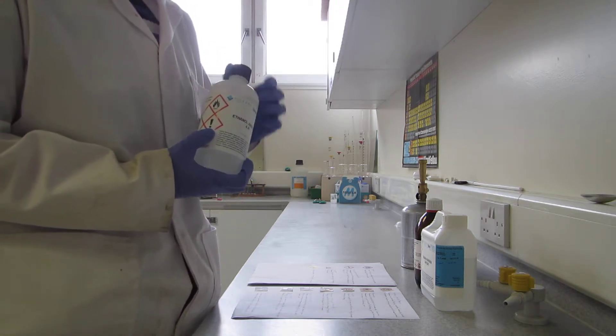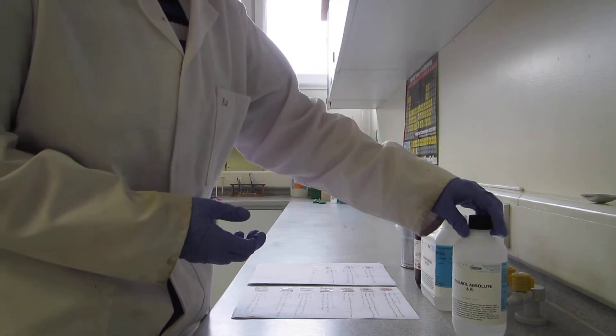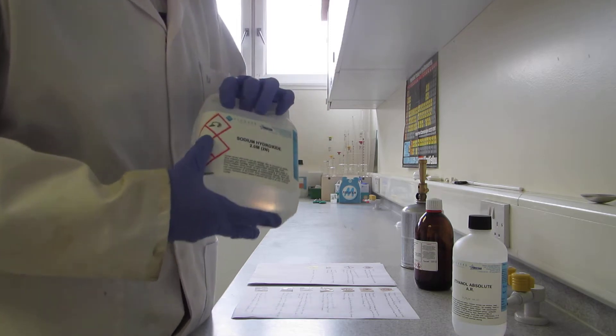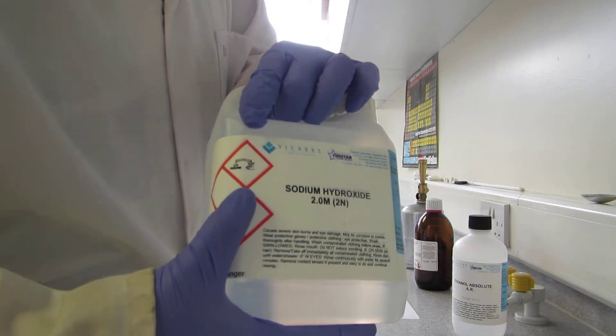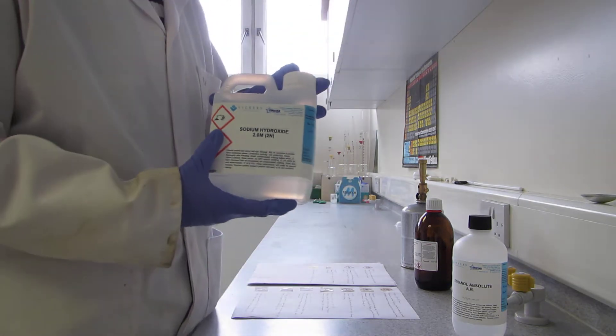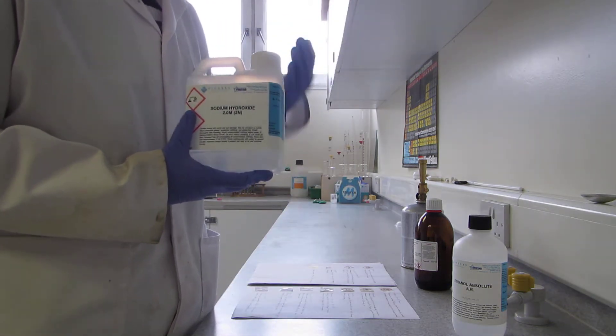The next symbol is the corrosive. This means that the chemical can cause burns to either the skin or eyes. If you wear correct PPE, this should be enough to protect your skin and your eyes.